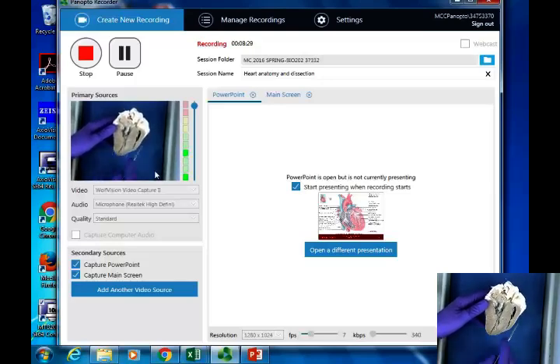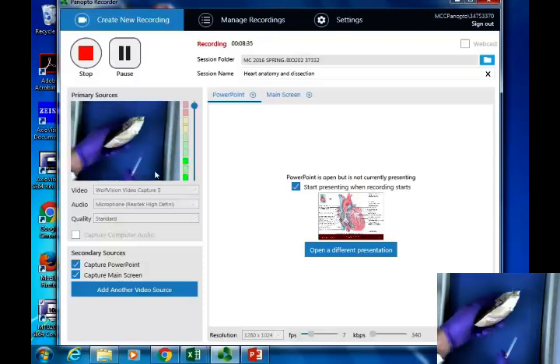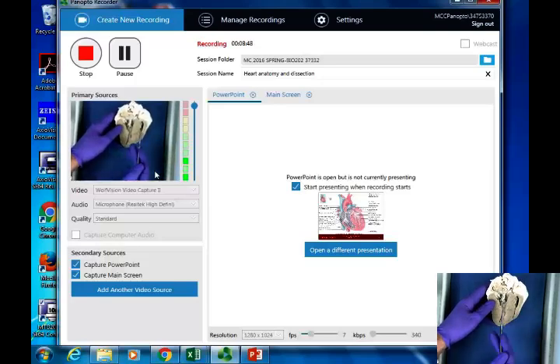And we can tell because of that wall. So things that we can identify in the dissection, like we said, we could do layers. So we could point to the surface of the heart here and say what that layer is, the epicardium. You would then point to the middle of the wall, anywhere along here, and we said name the layer, it would be myocardium. And then if we pointed inside the chamber, that would be endocardium instead.